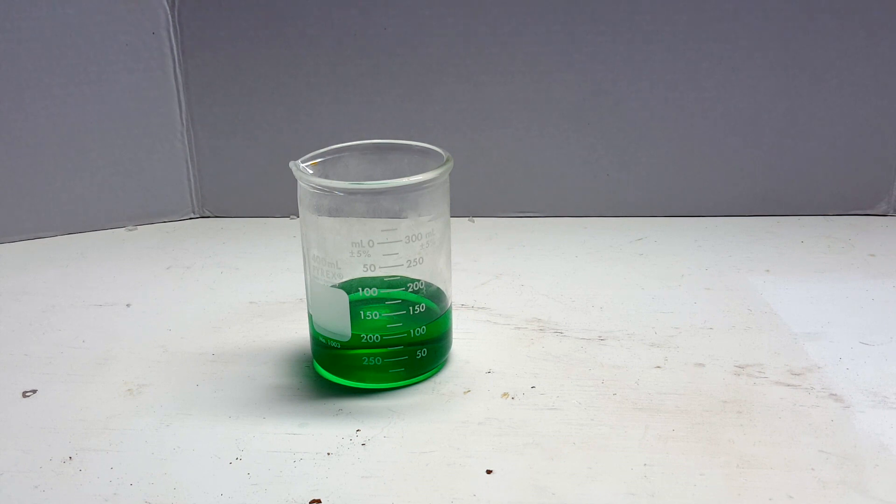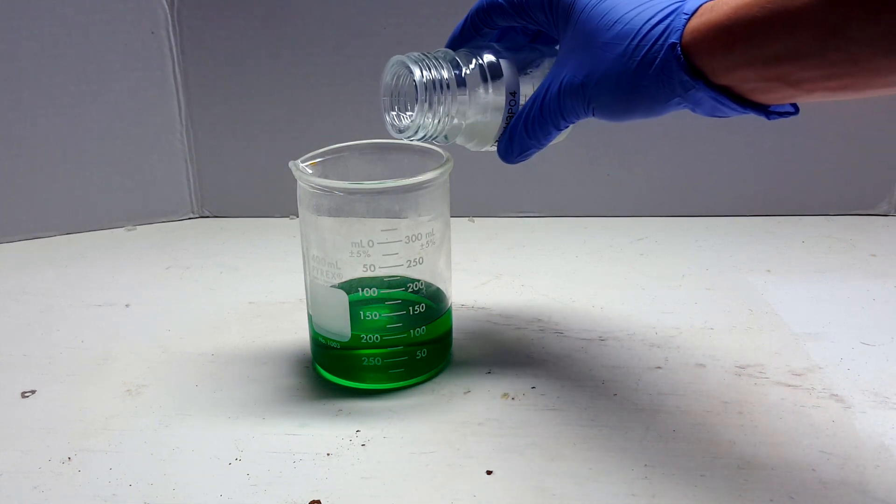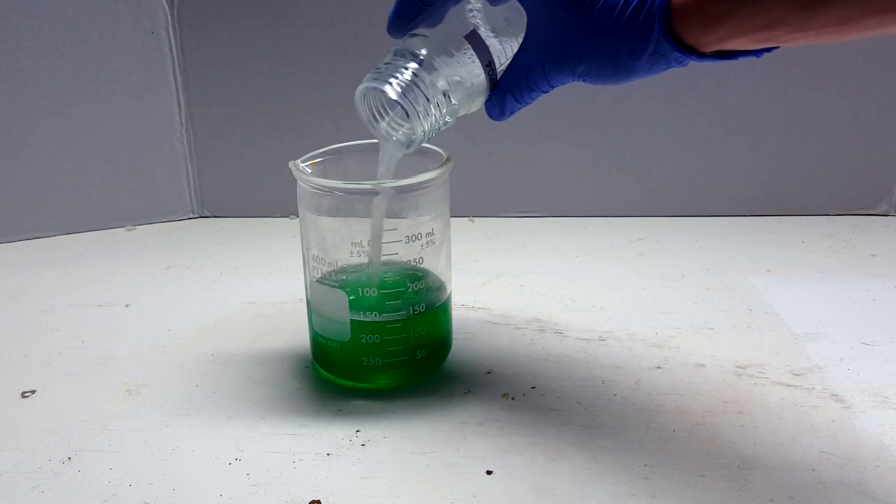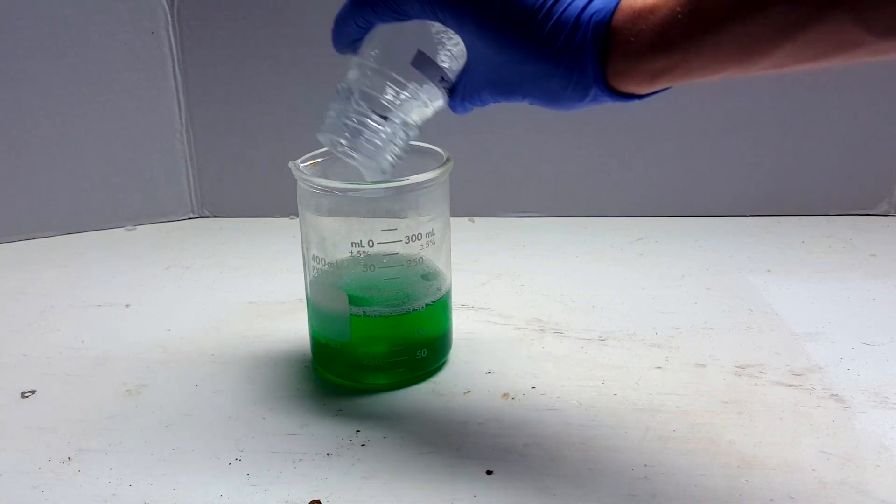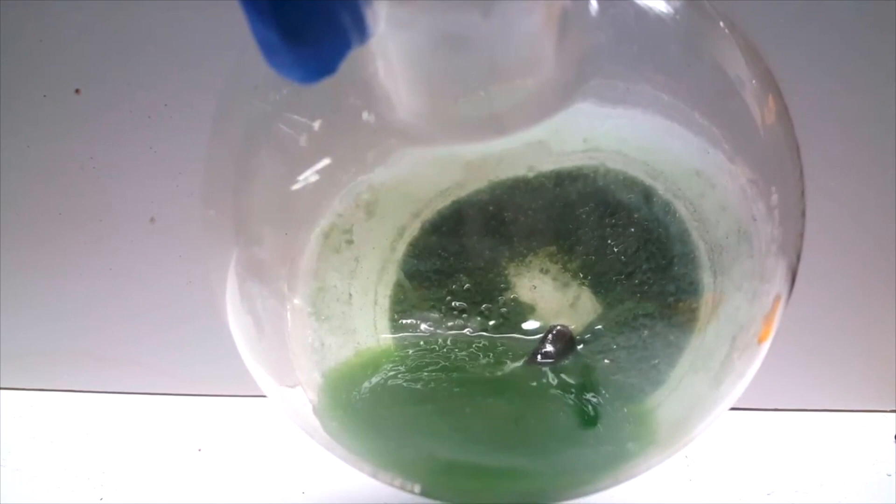So I decided to attempt this project over again. I combined the extracted phosphoric acid with the green solution so I could get a maximum yield from the original rust remover. Before going into the distillation, I want to discuss some of the issues with my previous attempt.